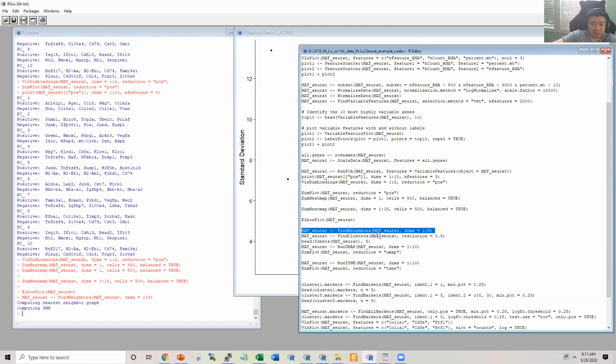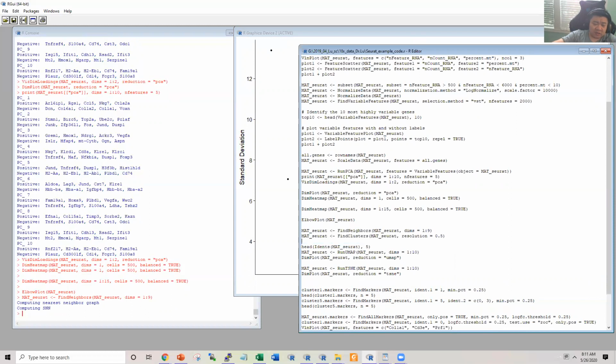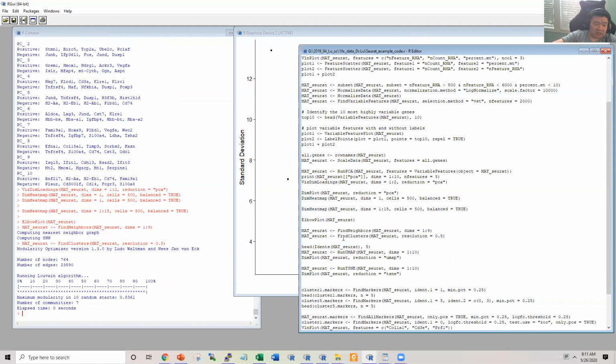Then the PCs are used for network-based clustering. Seurat uses a network-based clustering based on certain top PCs. In the past they used KNN, but right now they are more optimized. But I believe that for certain data, this method doesn't perform very well. But as a general tool, I consider this okay here.